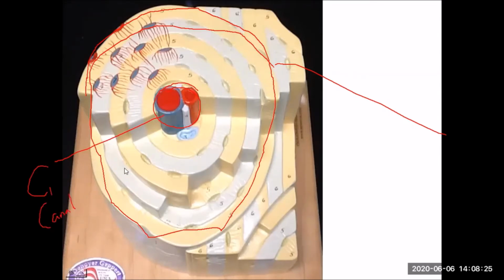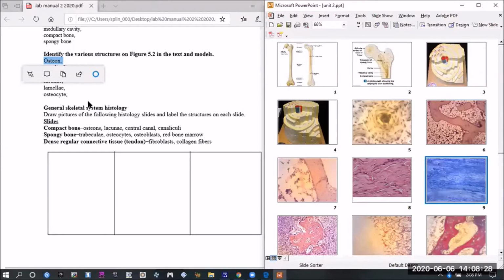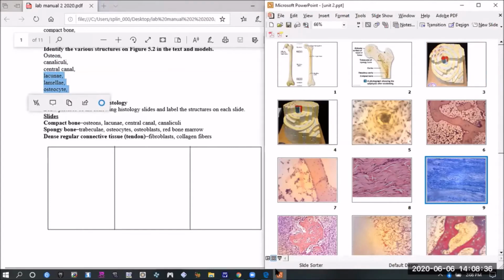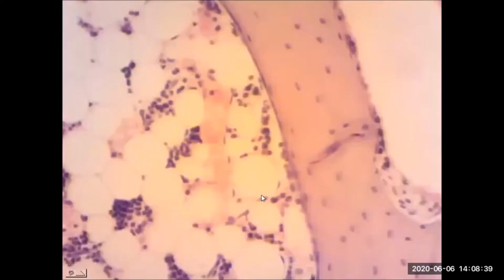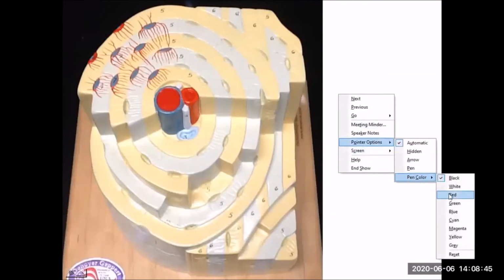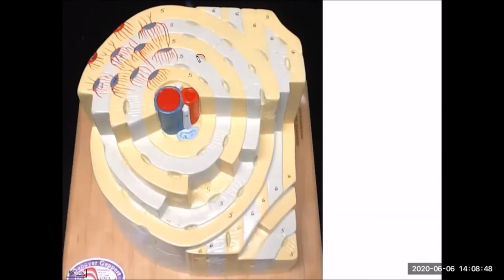And let's continue from there on the list. So we have the lacunae, the lamellae, the osteocyte. So the lacunae are all these hollow cavities within the osteon. And these are empty lacunae seen here, whereas in blue, these are the osteocyte cells that sit within the lacuna.